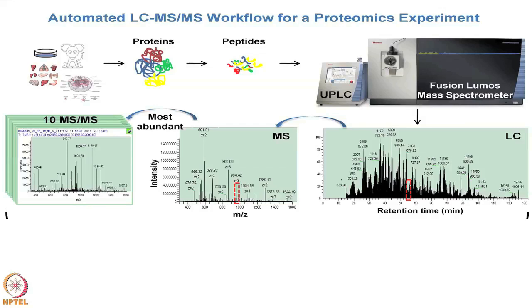It's going to separate the peptides chromatographically, eluting them over time based on their hydrophobicity. In this description here, that runtime takes about 120 minutes. At some given point in time, a scan is going to happen. This takes about 10 to 100 milliseconds now. The first thing you would do in a cycle is take an MS scan.